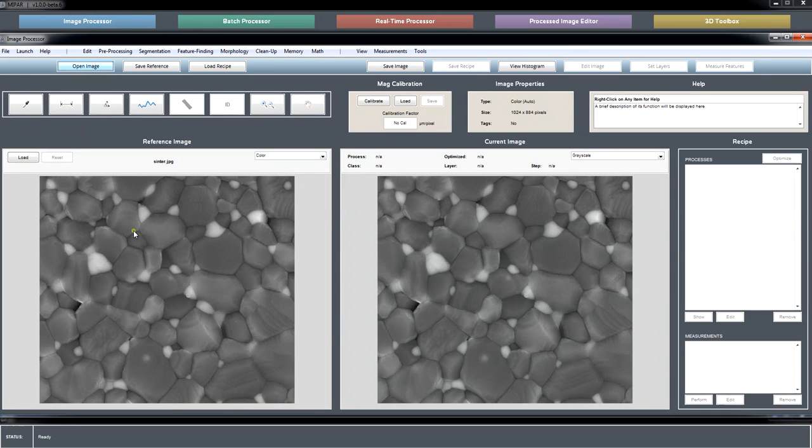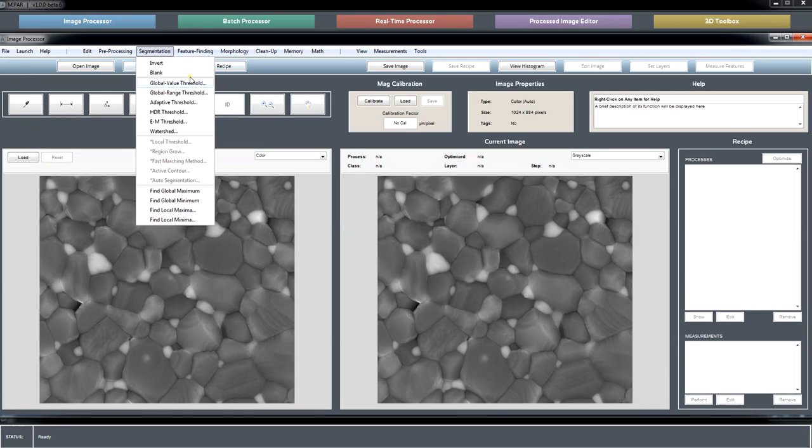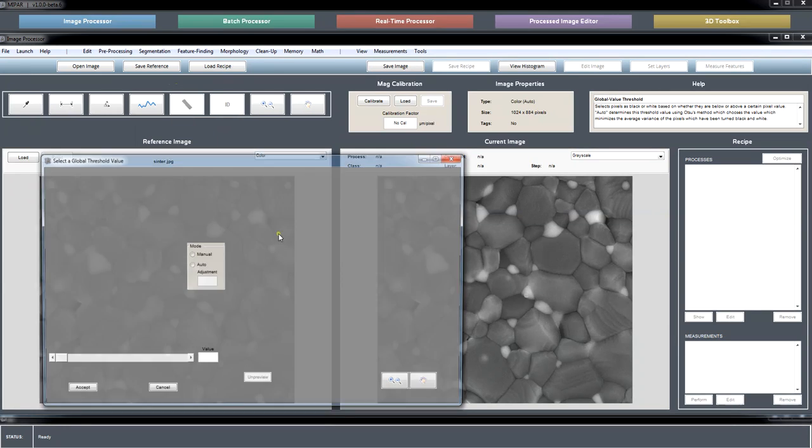So you're going to have your full color image as your reference if you work with color images, and it's automatically going to choose the auto scheme to turn it into intensity data for the processing. Because I think that got a little bit annoying, always having to deal with that dialogue. Just a side note there. So image is opened. We'll use this image later on, maybe for some examples.